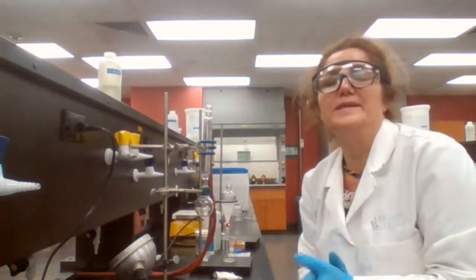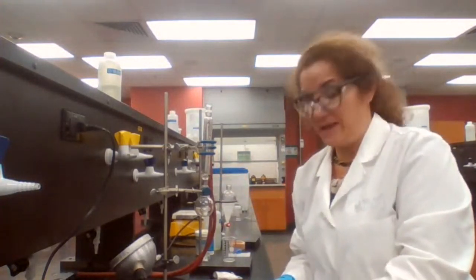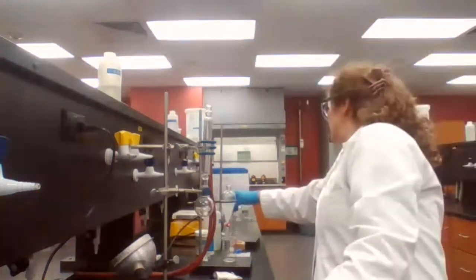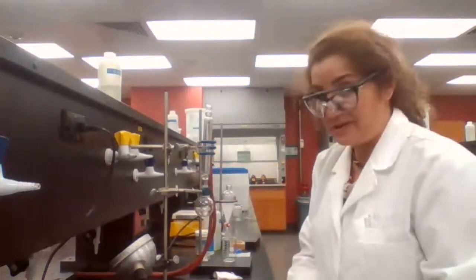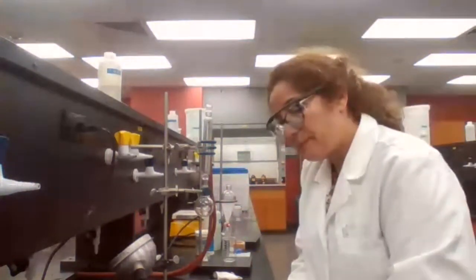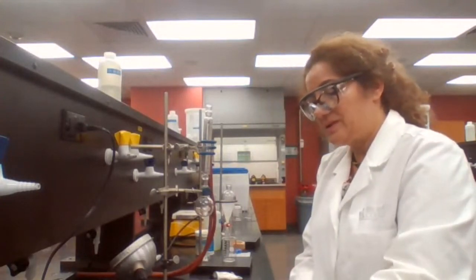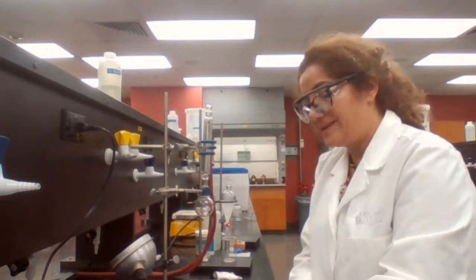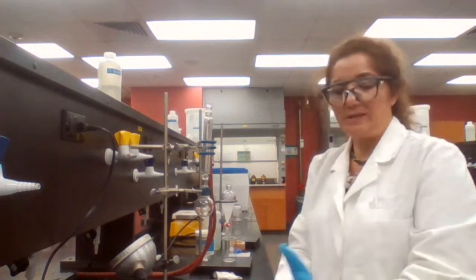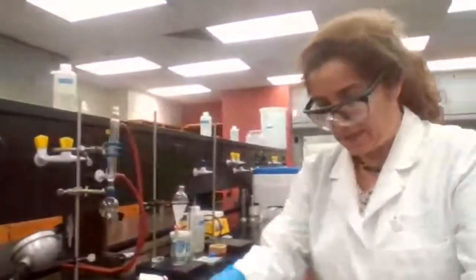The size of the separator funnel is 125. The one that we are using now is 125. And I used 30 milliliters of water. The quantity of the water is not going to make a huge difference because it's just the aqueous layer. We are going to bring 35 milliliters of the t-butyl methyl ether. Shake it, vent it, and bring it back to separate it.